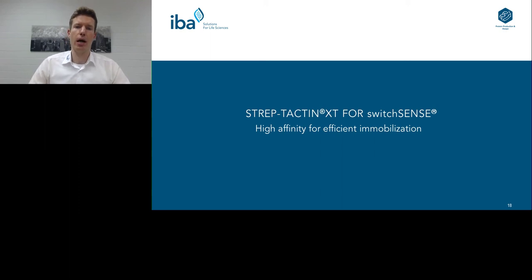SPR is one way you can measure binding affinities and kinetics, but there are also existing alternatives, and one very interesting alternative is the switchSENSE technology that can also be used for kinetic studies and measuring binding affinities, but also for many other applications. This technology is provided by Dynamic Biosensors, and they provided the following data, which are from their development of a Strep-Tactin XT chip.